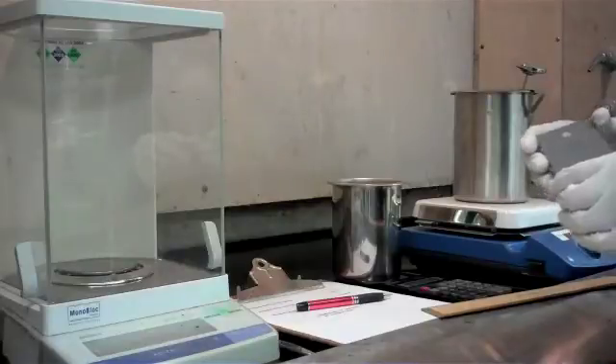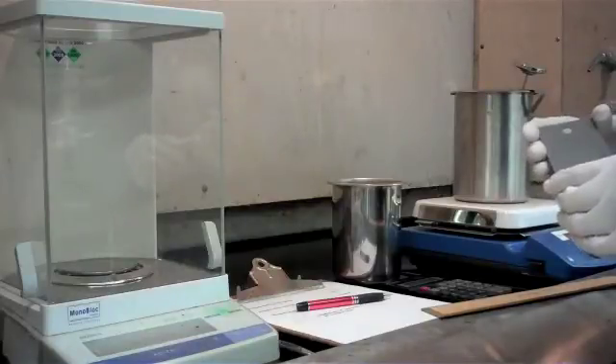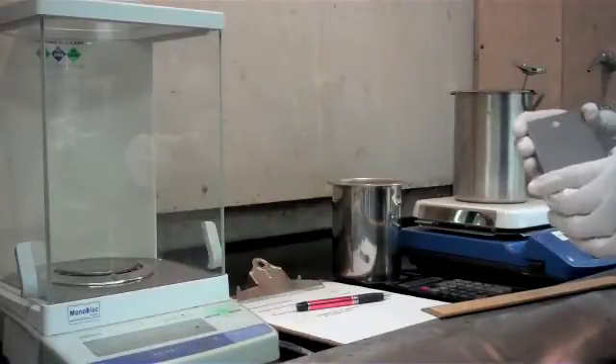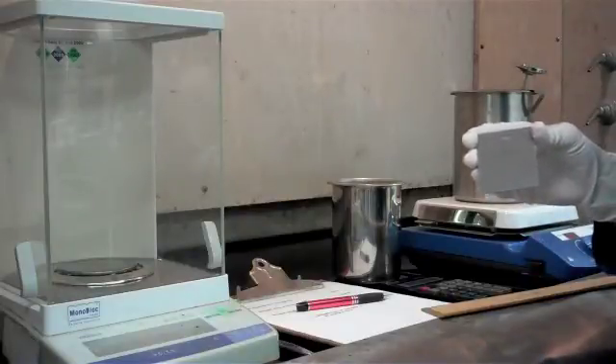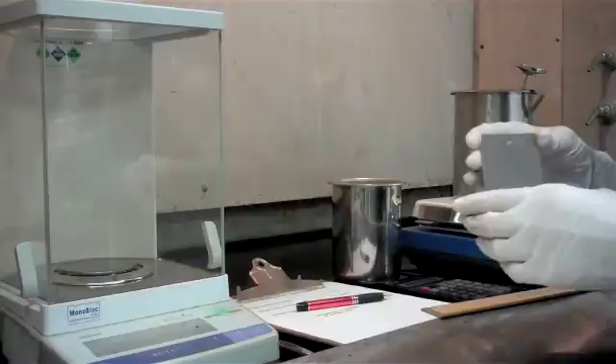We're going to demonstrate phosphate coating weights today using a chromic acid solution. The first step in doing a coating weight is determining the surface area of the part that you're going to be doing the coating weight on.